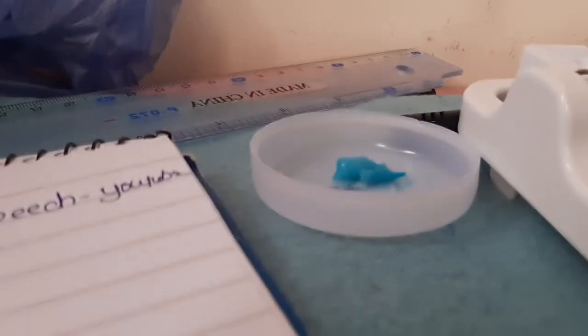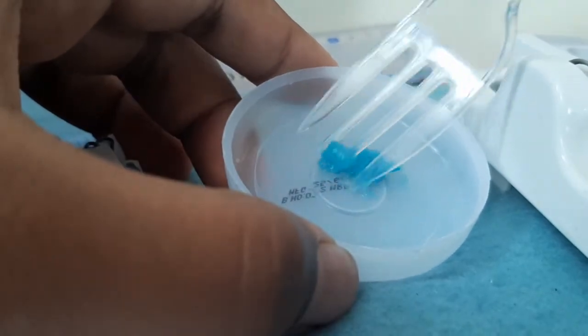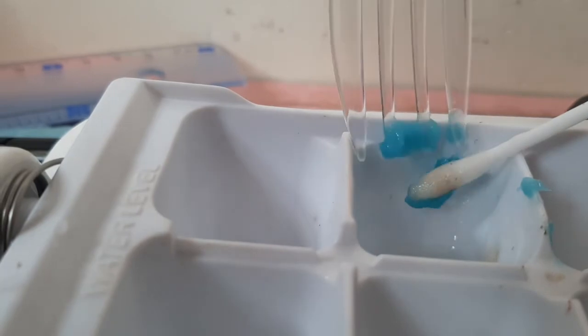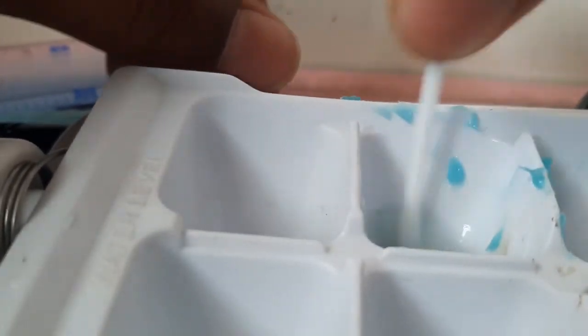So let's try it right now. Over here you can see there is some of my gooey detergent. So let me add it to the ethanol. Okay, so over here you can see that I'm going to add it. If you have a spatula, you can also use it. This is some kind of gluey, but let's put it in and mix it a little bit. Okay, you can see, let me move a little bit forward, and here you can see it's a bit gooey, but I think it will change the color. And you can also see that there are a lot of bubbles over here, and the ethanol has changed the temperature, and this creates hydrogen.